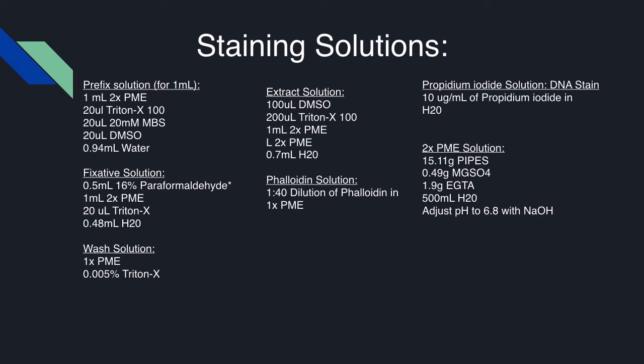The fixative solution's purpose is to open and preserve the tissues. The wash solution's purpose is to take out and stop whatever solution was before it. The extract solution's purpose is to put more holes into the lipid bilayer.